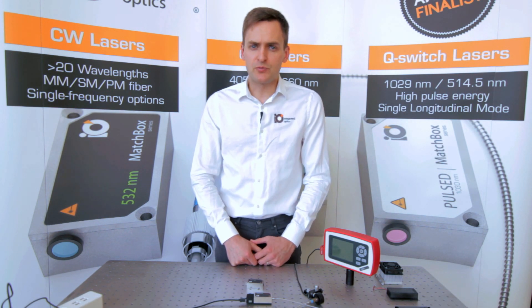With Matchbox we have always sought for simplicity and ease of use. Virtually any other laser can be replaced with Matchbox. Matchbox is simply the smallest laser in the market. Let's take a look at how we can do that using these accessories.